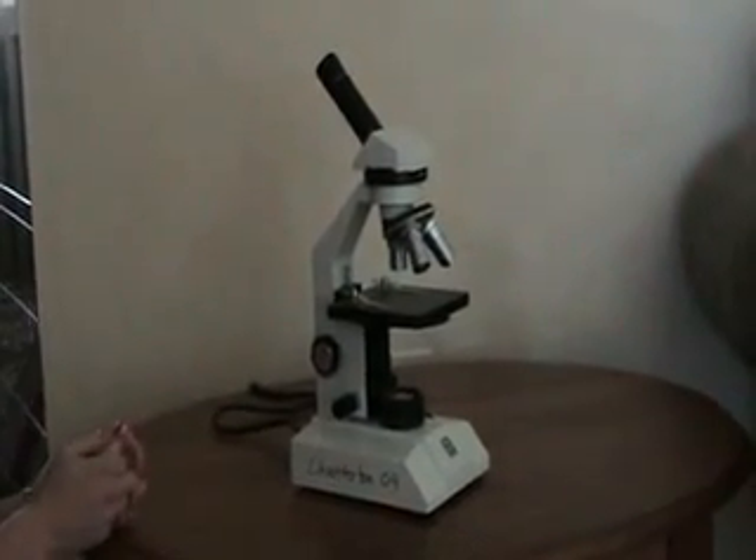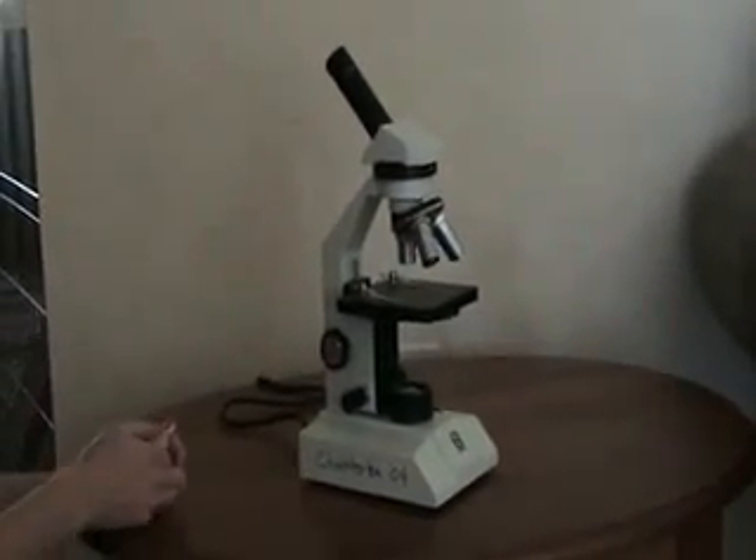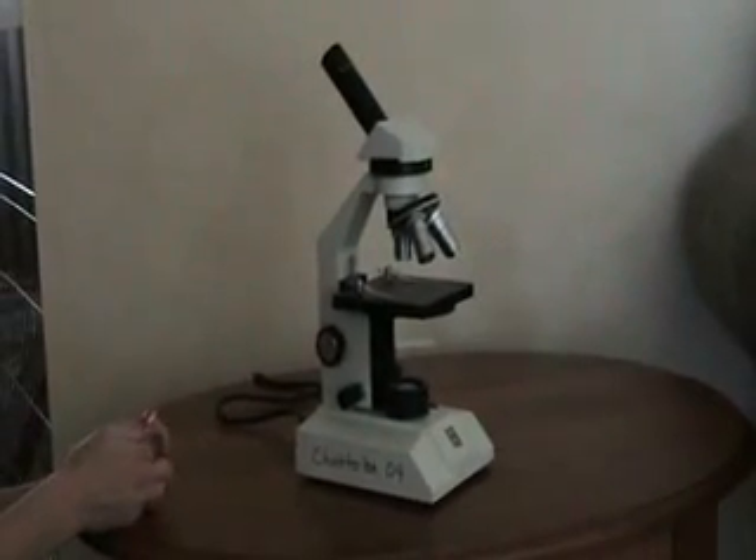Welcome to another edition of Chatterton Helping Hands. Today we'll be talking about the microscope.